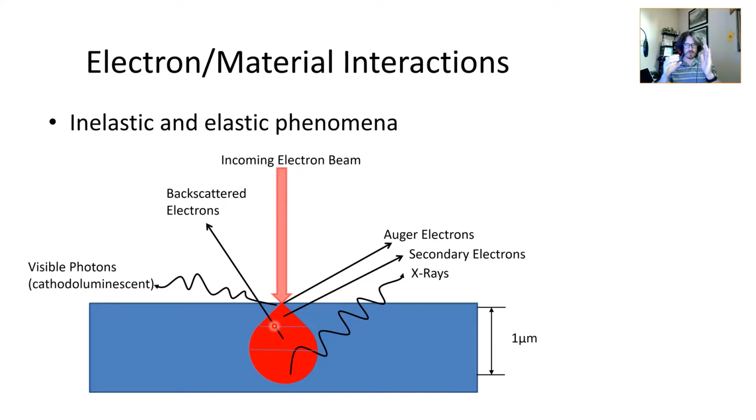You're accelerating your voltage to the same potential. So they actually have similar landing energies to that of the electrons in an X-ray generator, but there's less of them. So current, it's a little bit different than V equals IR. I've said this before, but current means you have more electrons hitting the surface. So the beam current is about 3 orders of magnitude less than you have on an XRD.